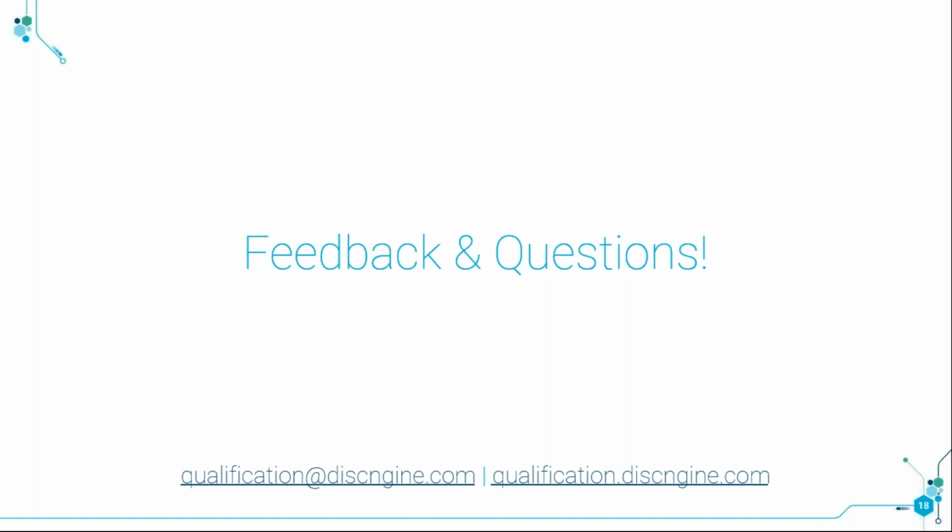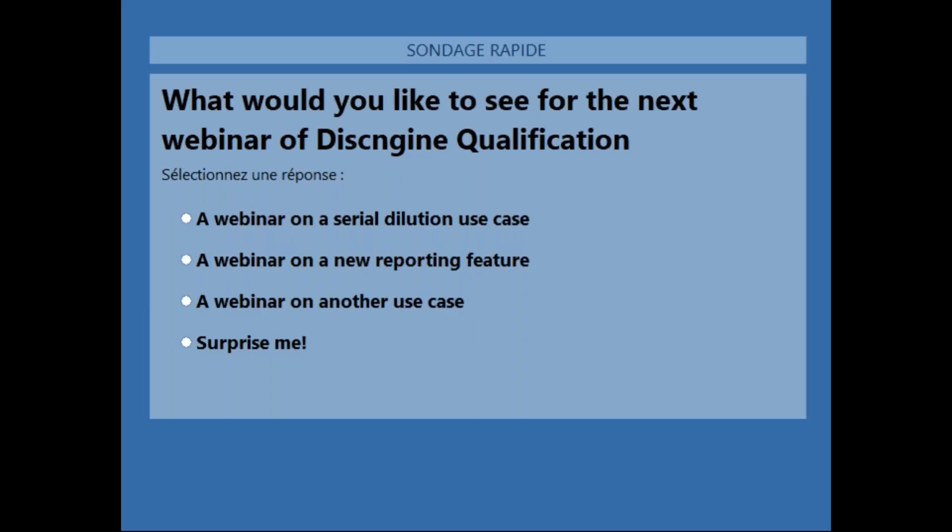Okay, I collected the answers, and we have another one for you, which is more related to you. What would you like to see for the next webinar of Discngine Qualification? We have a few subjects we can address. You can see a webinar on a serial dilution use case, another one on a new reporting feature we are currently developing for you, or we can address another use case that you send us.